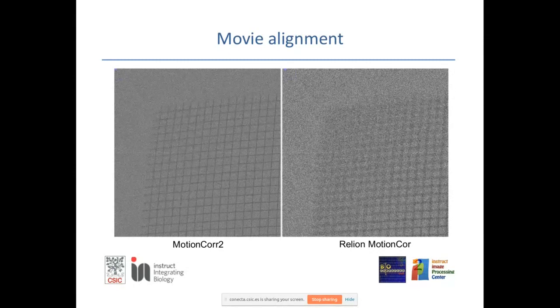So if you go to the middle of the micrograph, the middle looks nice. But if, for instance, you think that the sample is going in a doming, supposedly, or any other kind of effect, the corners may be important. Then MotionCor in this particular example didn't give a very good result.